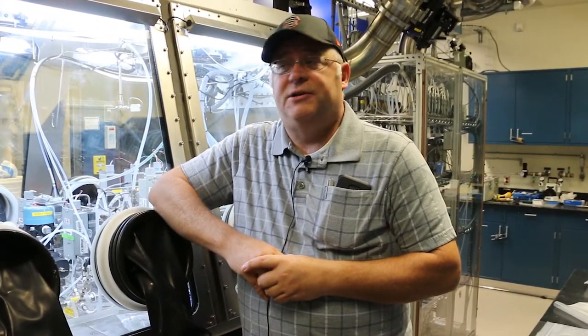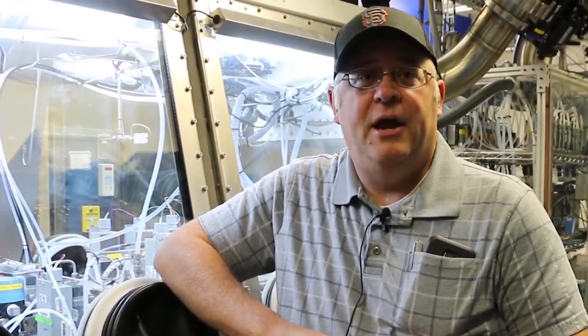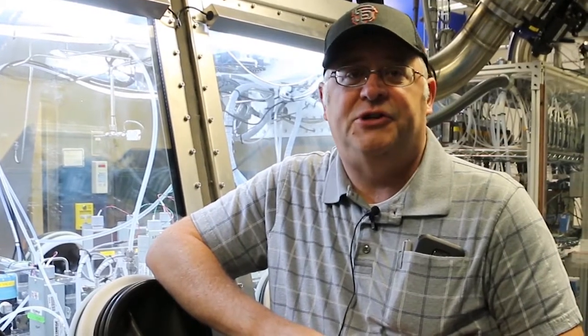So we originally decided to work on this fixture after running a test program called the Joint Expeditionary Collective Protection Program, where we had built several Swatch test fixtures that would disseminate vapor onto the materials that were to be tested. And we also had the fixtures that we normally use. The AVLAG fixture is becoming old and obsolete, and we wanted to design something that could replace both of those test fixtures and provide our division with a test capability that was unique, met the Army's requirements, and allowed us to operate more ergonomically and with less cost and expense to test programs.